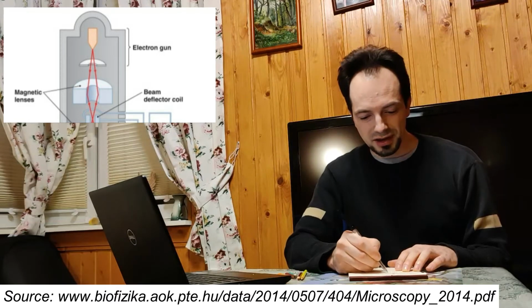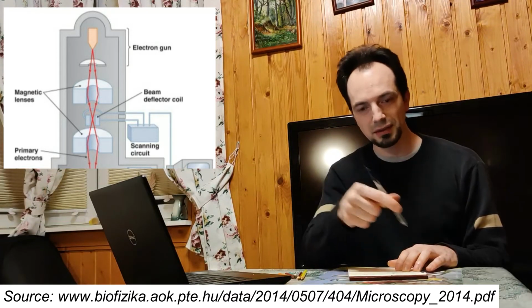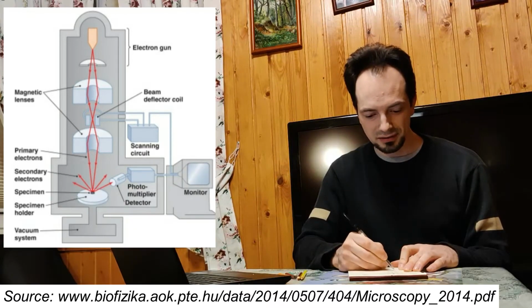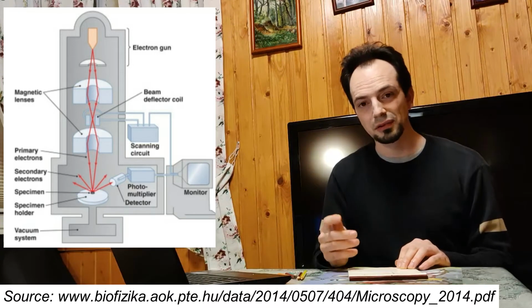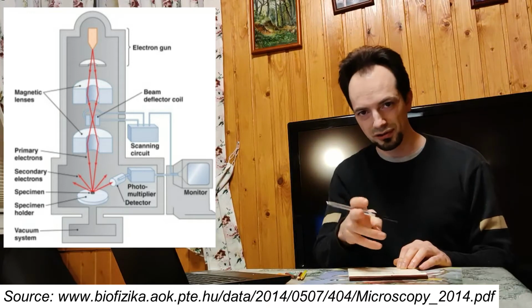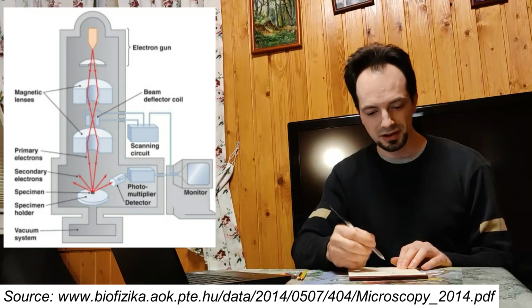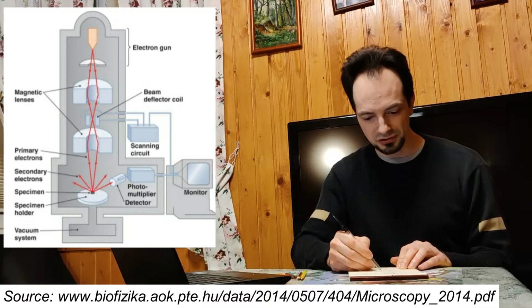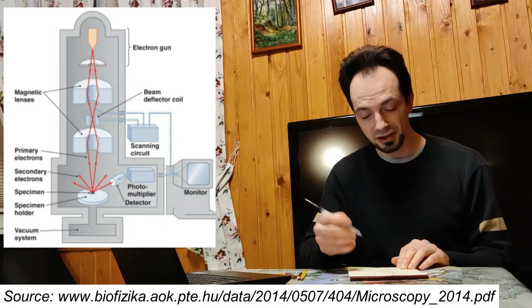In an actual microscope there are a lot of lenses and apertures, but I will draw quite simple here. The almost final stage are some coils, magnetic coils, that actually shift the beam, the coils that deflect the beam and enable that scanning motion. The final stage is the sample stage, the table on which the sample sits. Usually the table has controls of movements in 2 or 3 axes and rotation maybe in some devices. And the whole thing is inside a vacuum chamber.